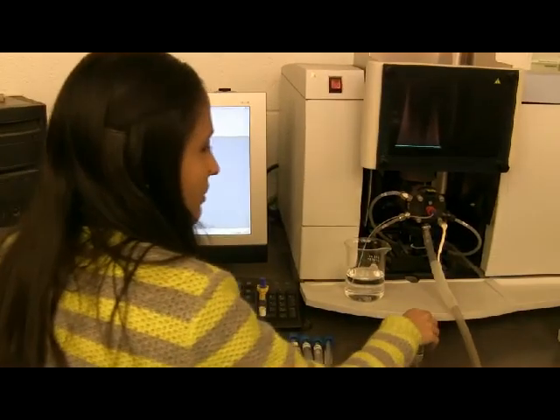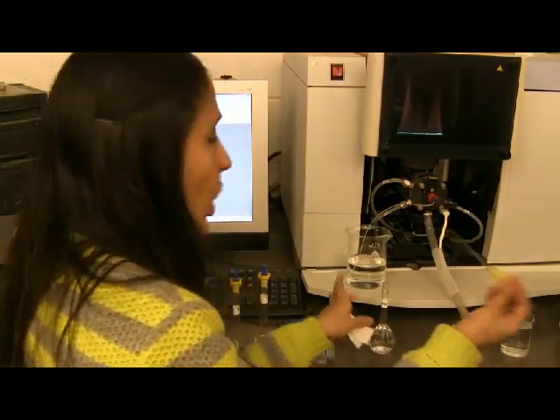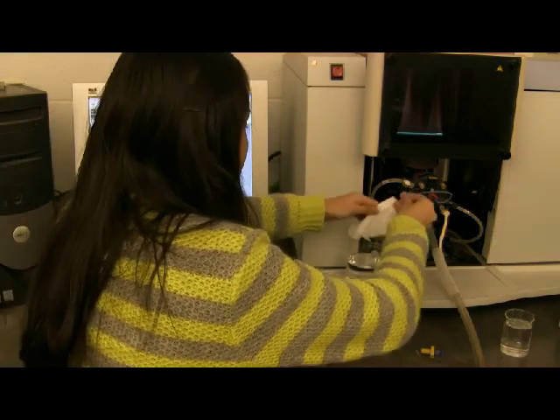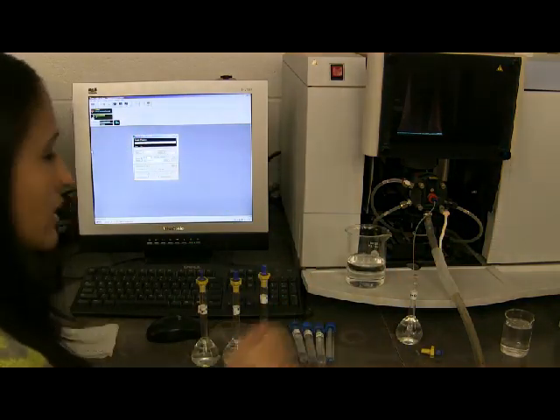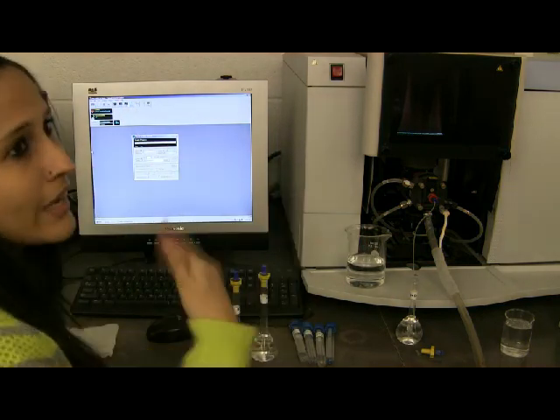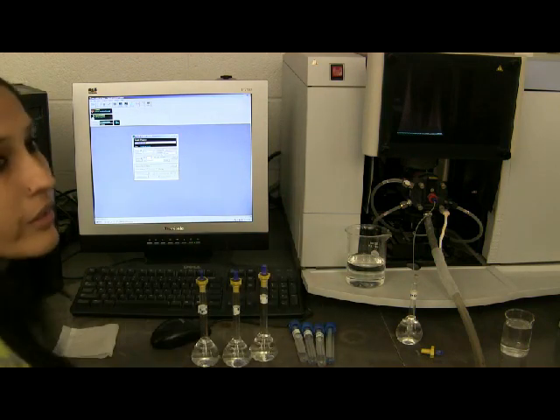Put it back. And then this is my 5 ppm solution. You can test it again if you want, like click on analyze blank again, you'll get it. So clean it and put it in your standard, and I wait for like 2 seconds. Even though it initializes the sample, I wait for 2 seconds and then I click on analyze standard. So 5 ppm is recorded also.